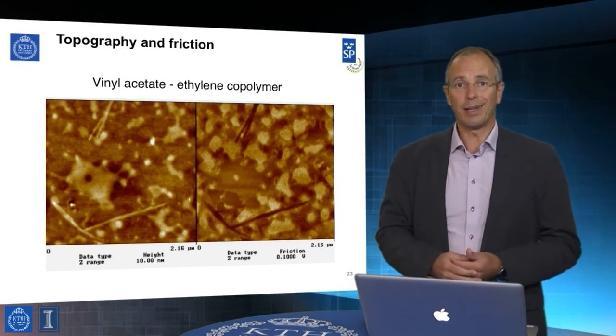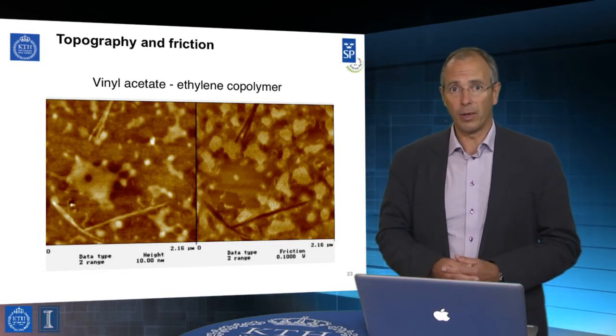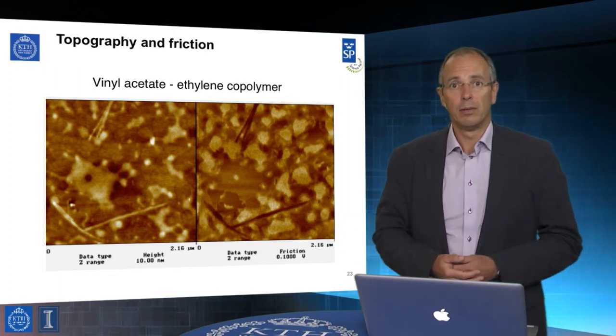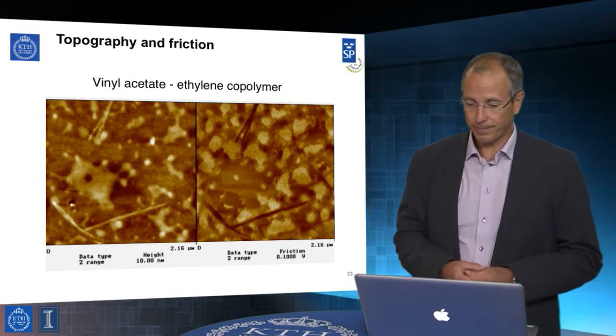And that means that we're looking at things of different chemical nature there. So by looking at that image, we're not going to say what they are. With an XPS, we can say what they are. All we can see is that there's a chemical difference. So we do rely on having some knowledge of the properties of the material.